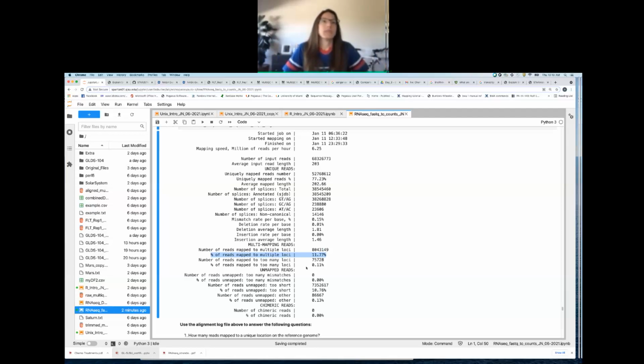Cool. Yeah, there's a whole bunch of information in here. I'm just asking you questions on the things that I look at mostly, but if you guys have questions about any of these things, feel free to ask away. Another question I got for you is, were there any splice regions identified? And if so, how many splice regions in total were identified?